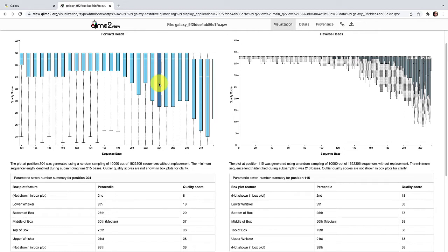This is an area where we'll see some variation when we get to the reverse reads, due to the subsampling that was performed on our dataset. Let's move on over to the reverse reads.